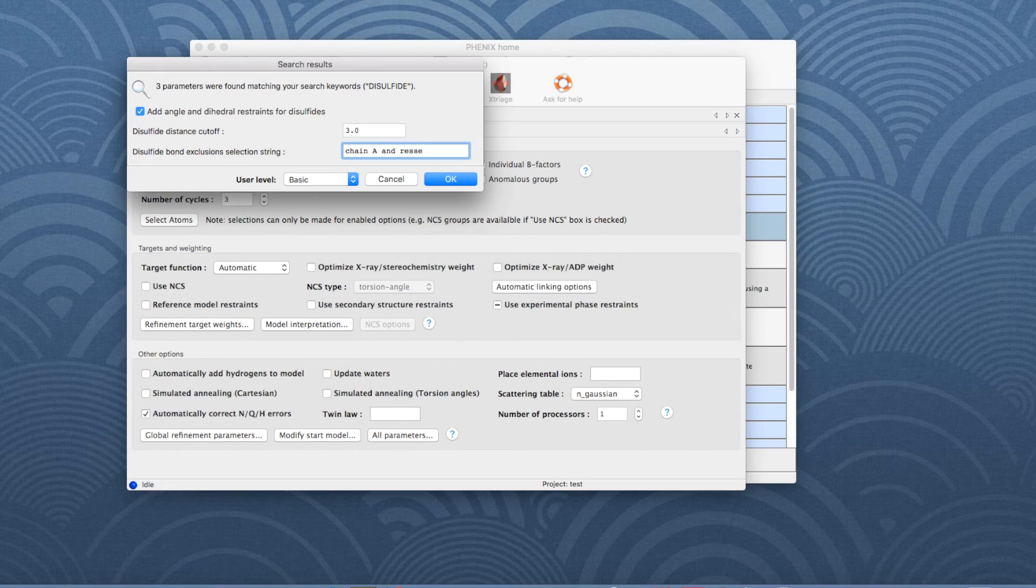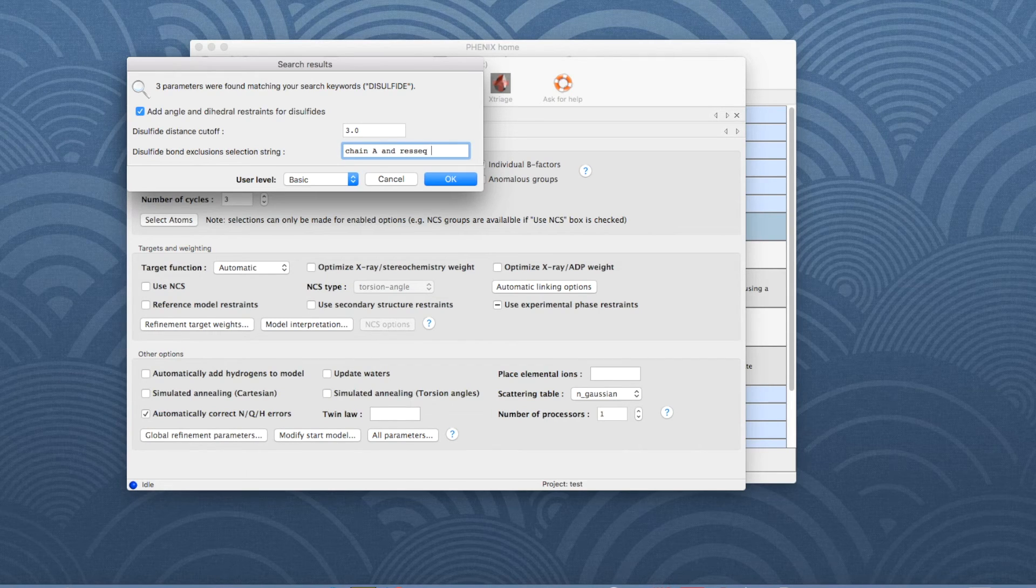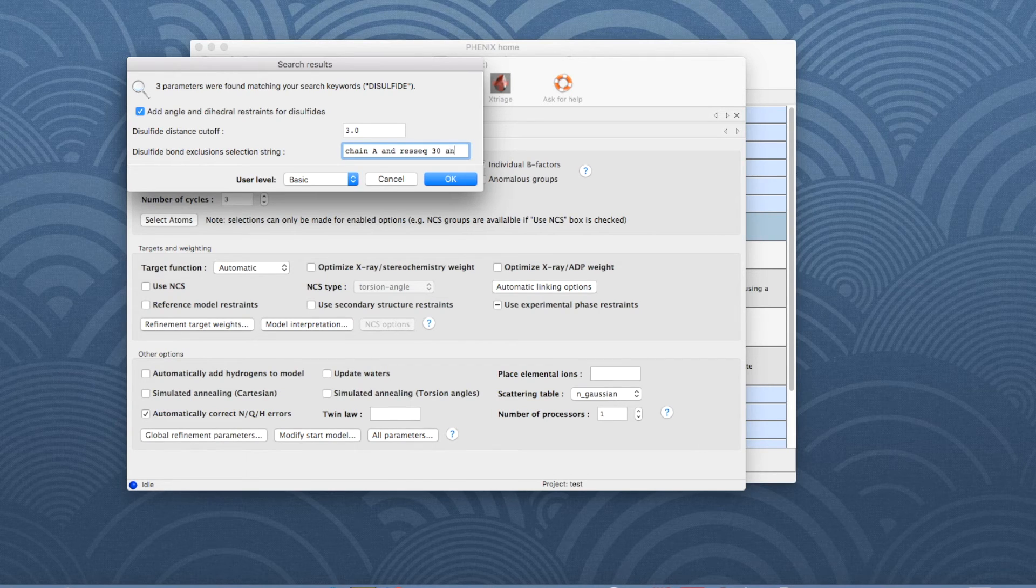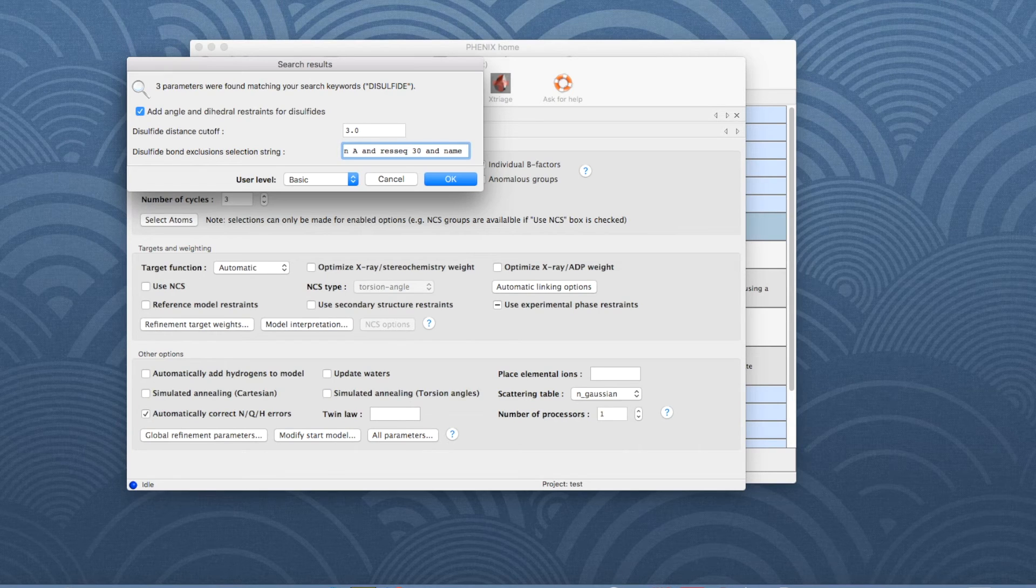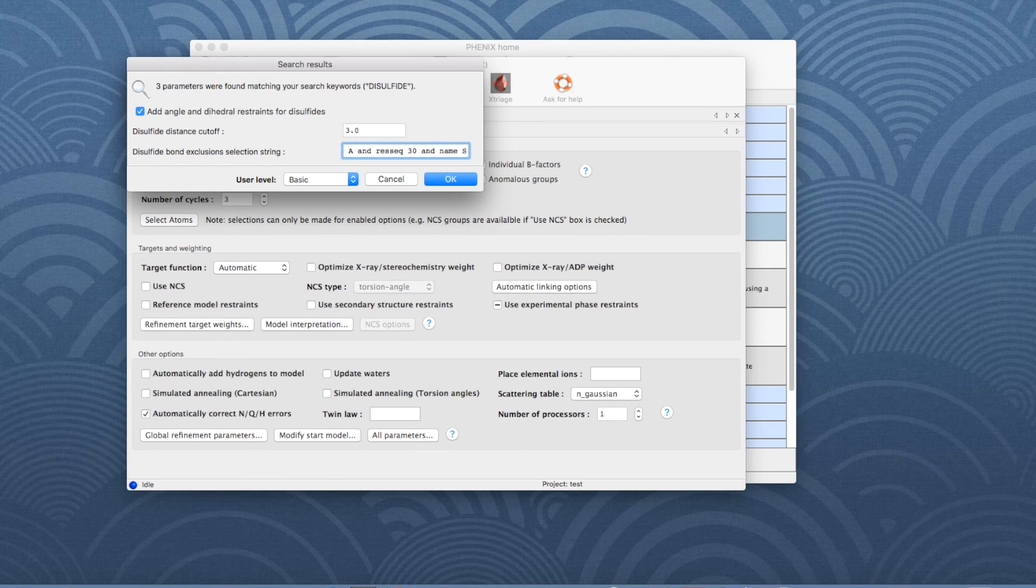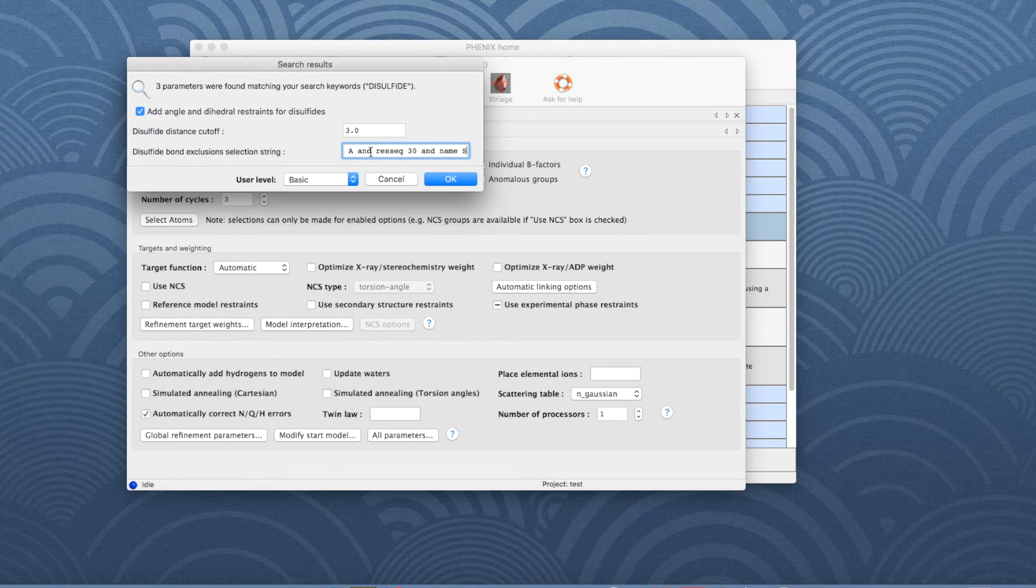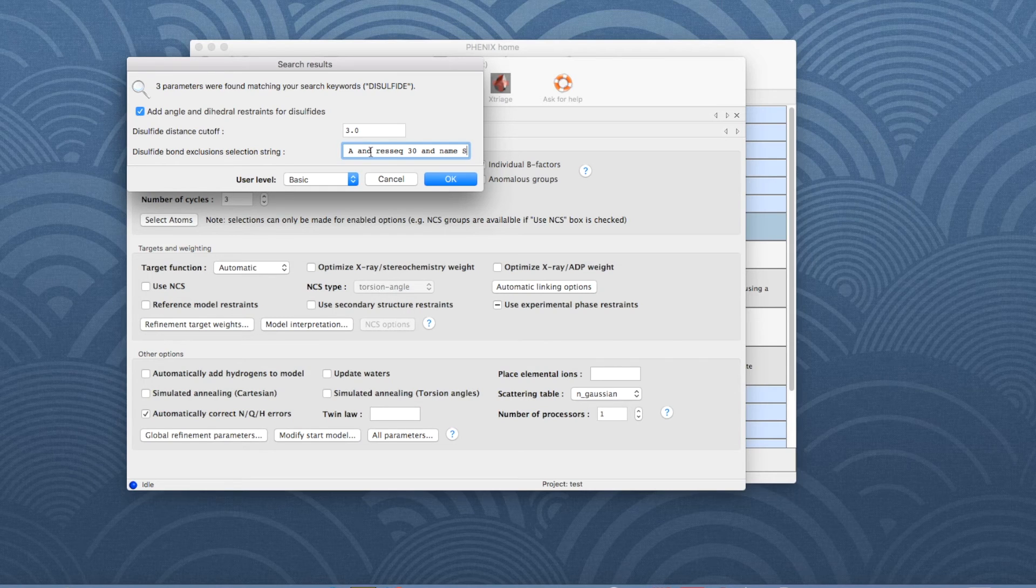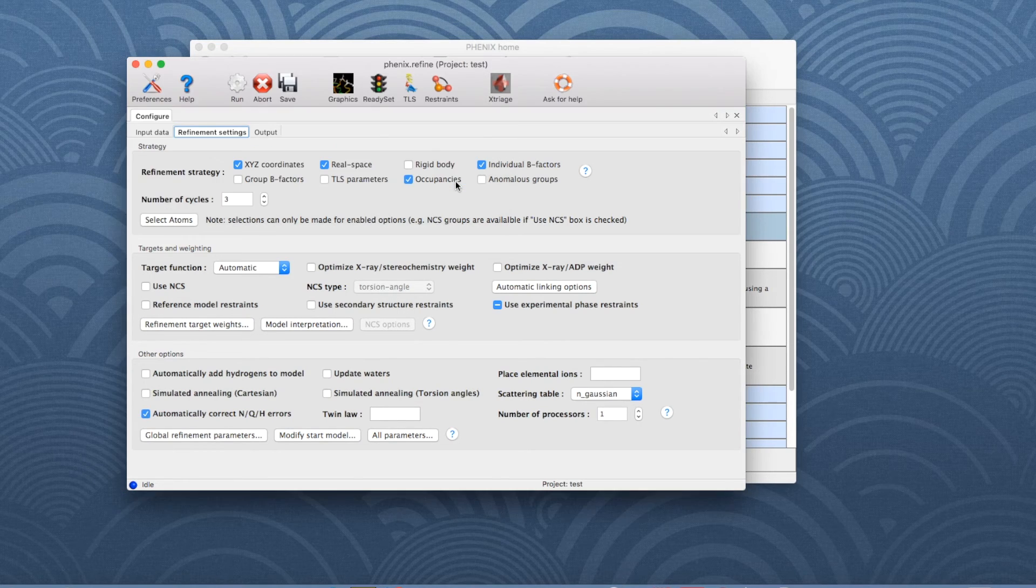For the disulfide bond in the lysozyme model, the selection string is chain A and resseq 30 and name SG. The sulfur atom in cysteine 30 will therefore not be considered as part of a disulfide bond. Then click OK to save the changes.